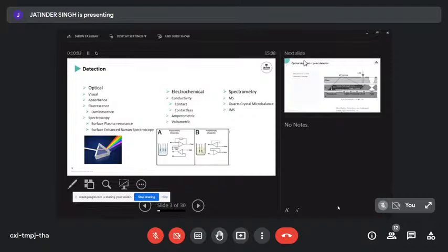We've got conductivity detection. It was very cool when I started my PhD. I was the first one integrating contact and contactless conductivity detection on microfluidic devices. No one remembers, but it was very cool in '99.